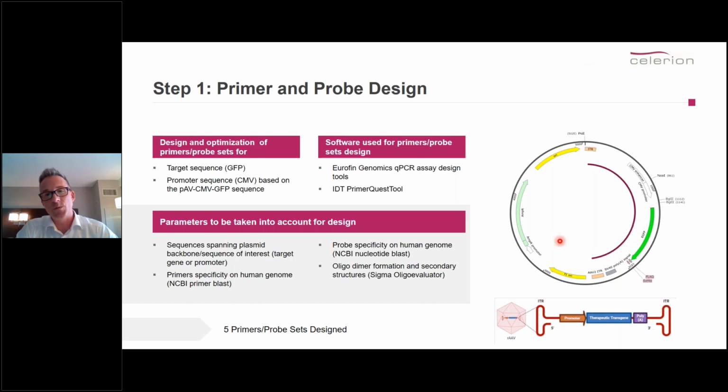So the way we've gone about this, we bought AAV8 reference material, which is commercially available. So this one has a GFP as the expression gene incorporated here. It's a good example to test it and to really show how to go about it.